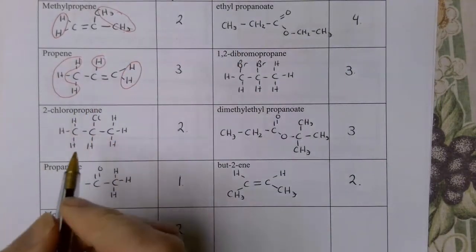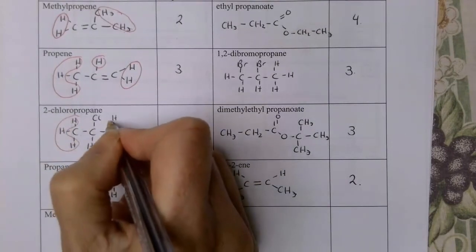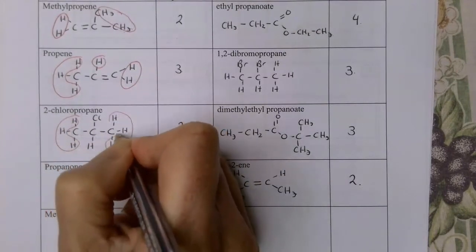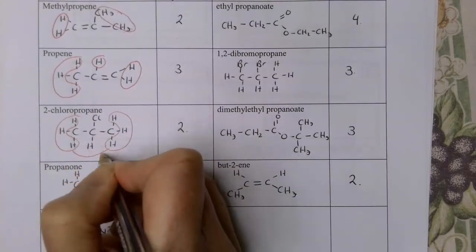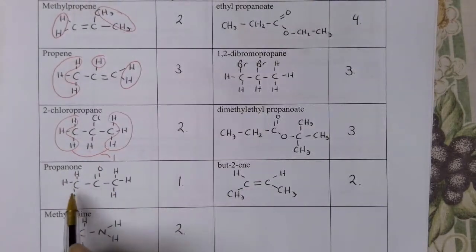The 2-chloropropane, these hydrogens on the ends of the molecule, they are in the same hydrogen environment. So that is just one environment. Again, here, propanone, all of these hydrogens are in the same environment. Doesn't have to be connected to a carbon. The hydrogens can be connected to a nitrogen or an oxygen. And here, methylamine, we have 2 environments.